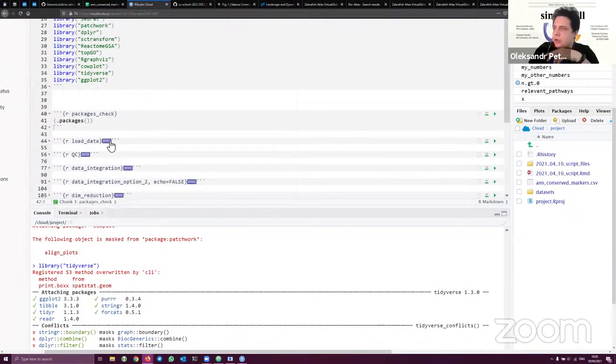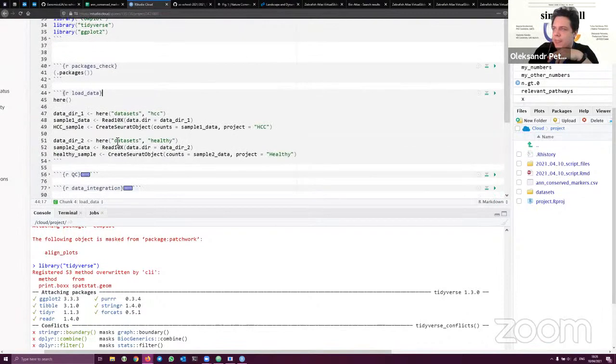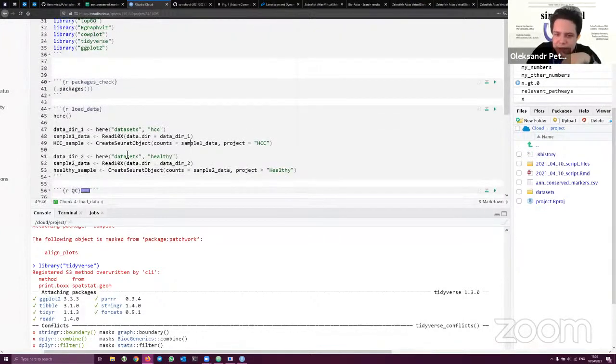Okay, dokie. So the very first step will be to understand... Sorry, I'm working on a Mac. In the Mac is it also Control-Alt-I? So Mac users, Marina or Władysław, what's your favorite command to create a chunk? I operate with the visual interface. I will try. I wrote it in chat. Usually for me CMD + Alt + I works. Oh, you put it in the chat. Okay, so thanks for this one. So I think this command, the second one, Command-Alt-I, should be reproducible for Mac users.